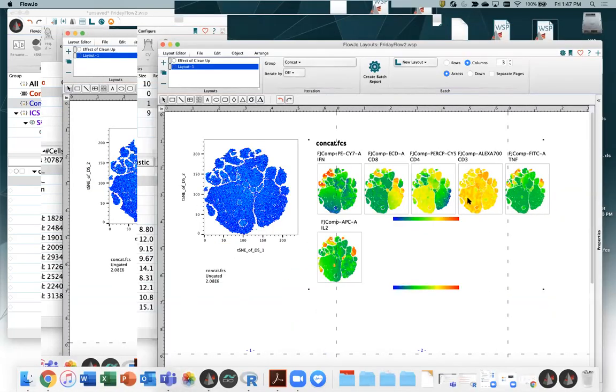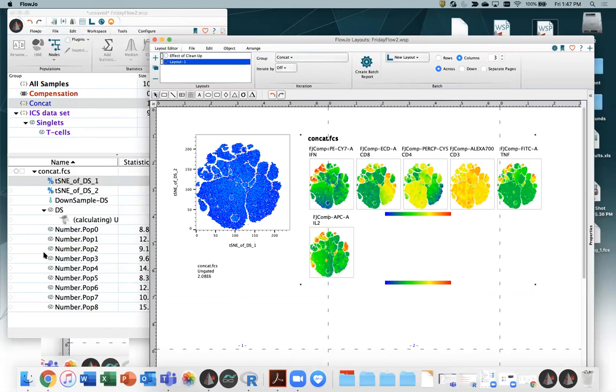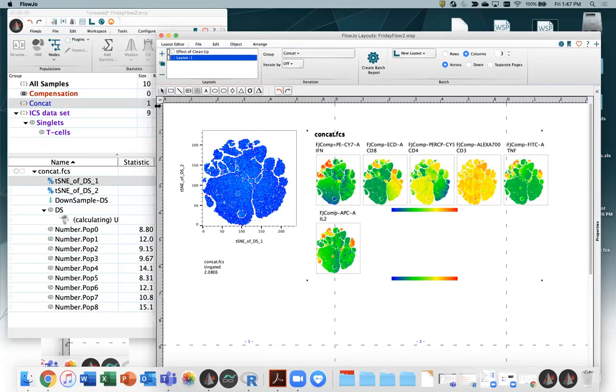All right. UMAP still calculating. I hate to throw a clustering algorithm while still thinking about UMAP. My apologies. I thought to run the t-SNE on the bigger file before we started. I should have done the same with UMAP so that we could have actually looked at these without having to wait for it to finish calculating. Anyway, sorry.